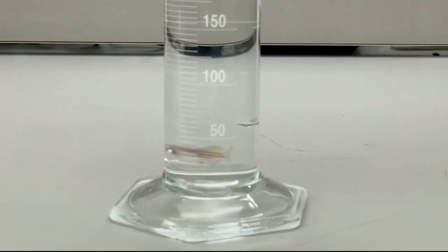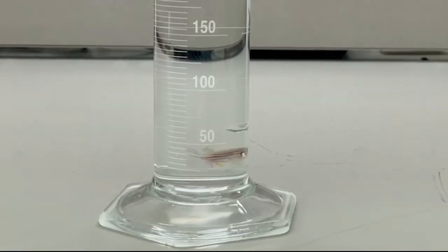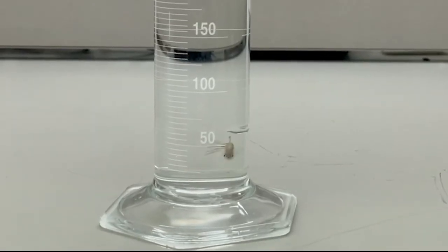In order to measure the liquid to make the agarose gel, the scientists use a graduated cylinder. But what is a graduated cylinder and how does it work?